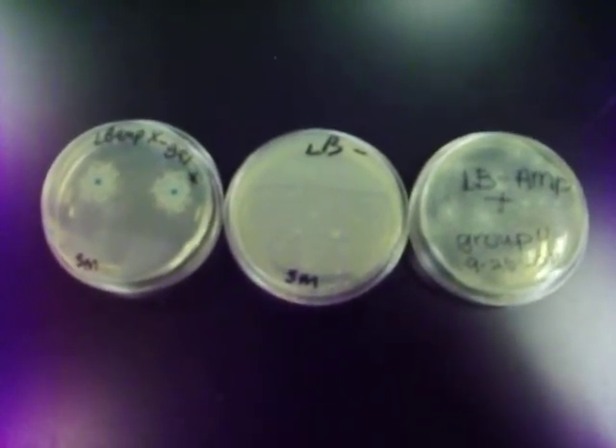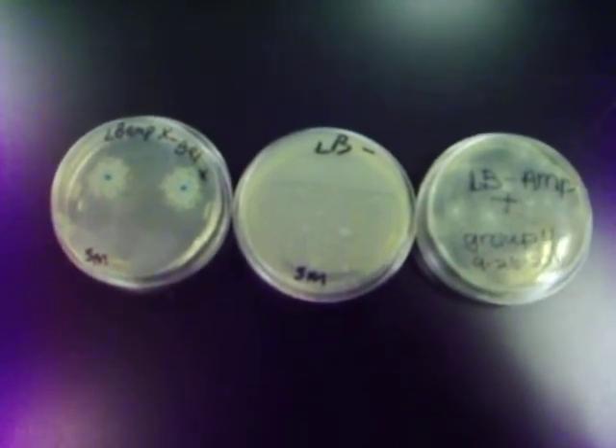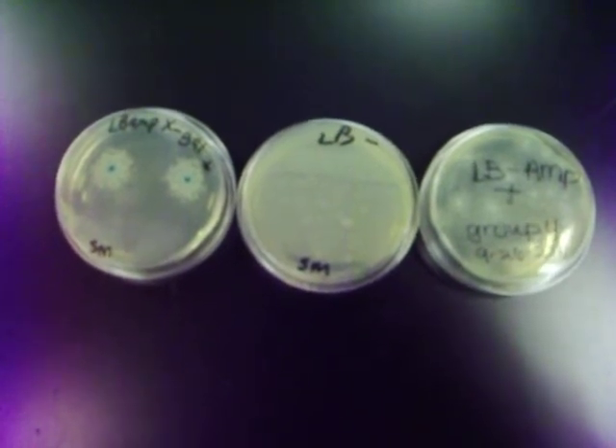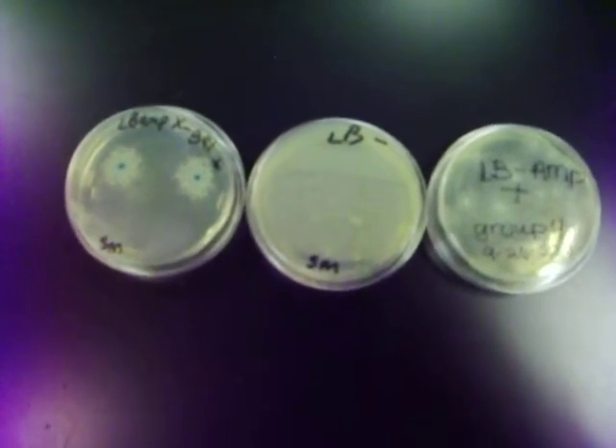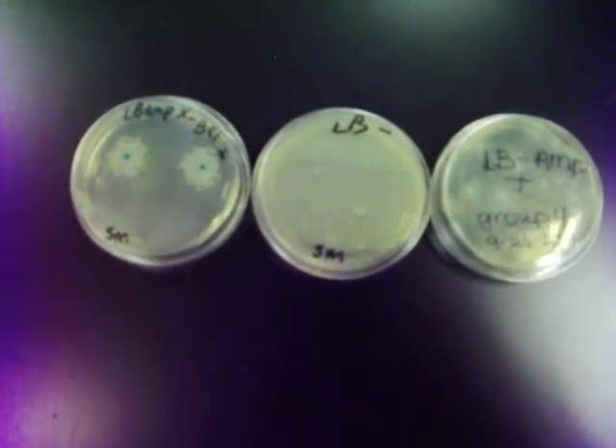So what we did is put calcium chloride salts in with the E. coli, which opened up the pores in its cell walls, which will allow the plasmid to enter. And the reason we put it on ice was to supercoil the DNA and make it smaller.